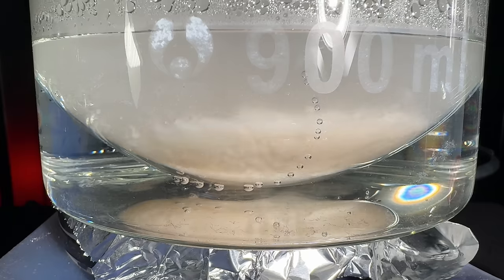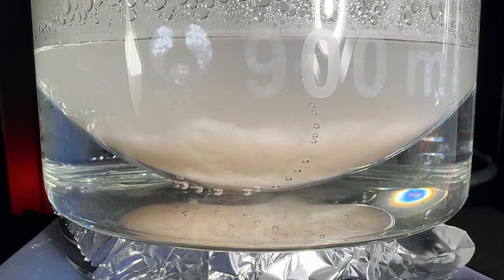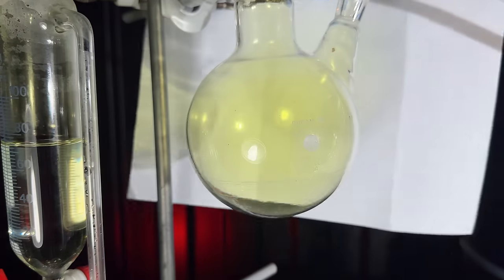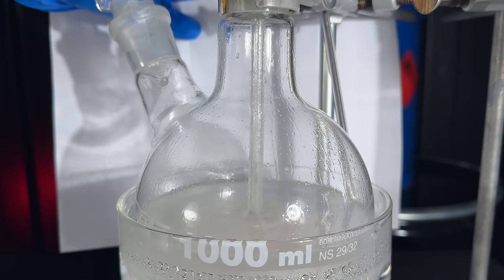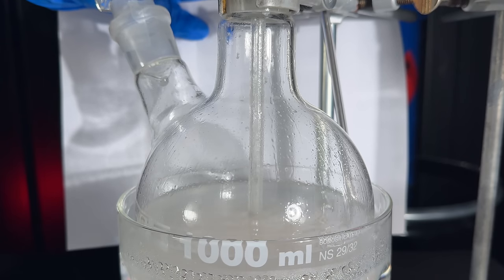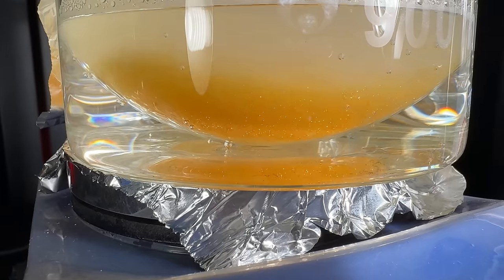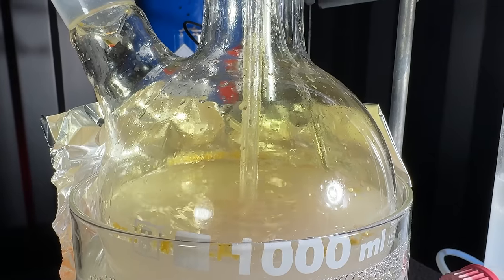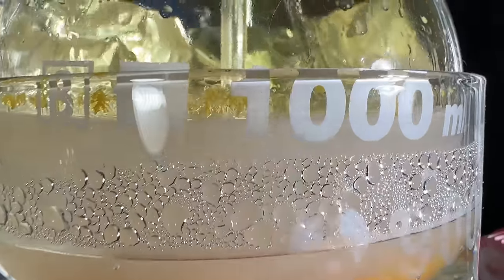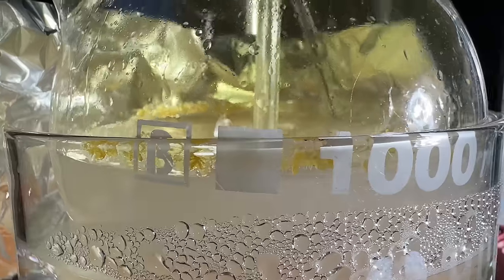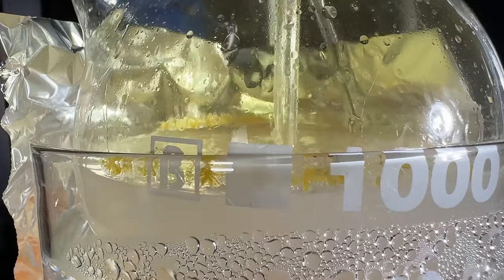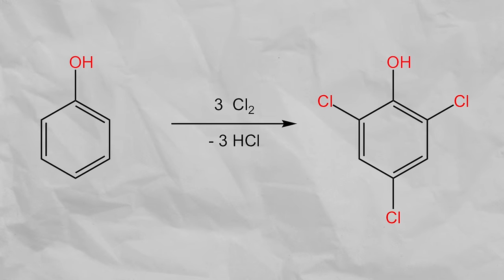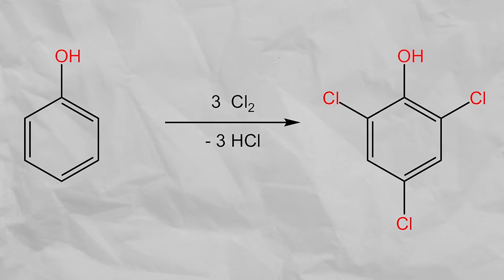It was relatively boring and there was no noticeable change. I raised the temp to 70 degrees Celsius. At this temperature, even most of the chlorinated phenol should stay liquid and this is important. I could observe that all of the chlorine was used up in the beginning of the reaction. However, as the reaction proceeded, I got color in the reaction flask and even those nice little crystals growing on the wall of the flask. This is already trichlorophenol. In this reaction phenol reacts with chlorine to form hydrochloric acid and mainly 2,4,6-trichlorophenol.